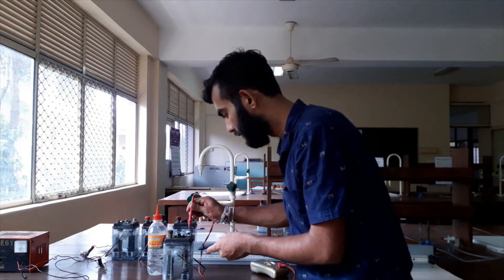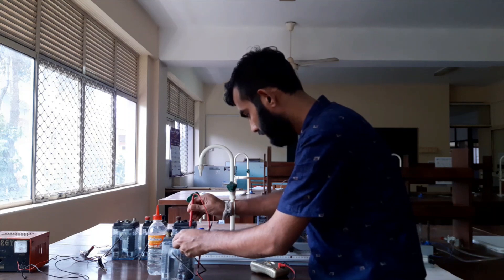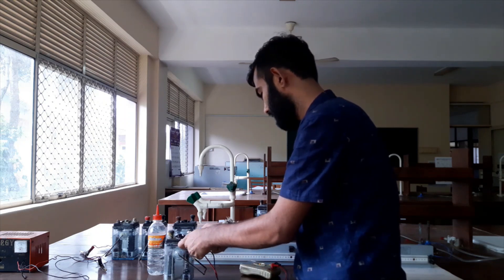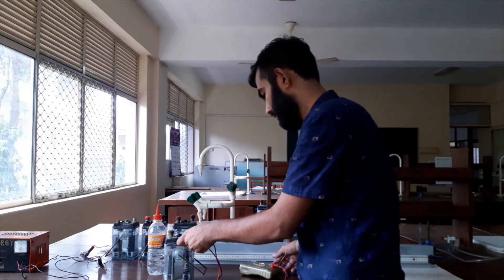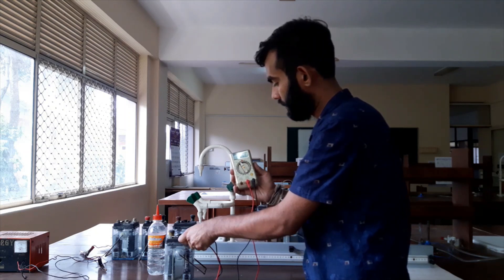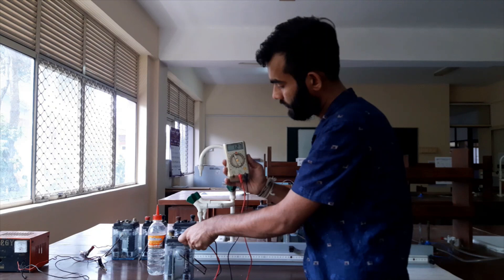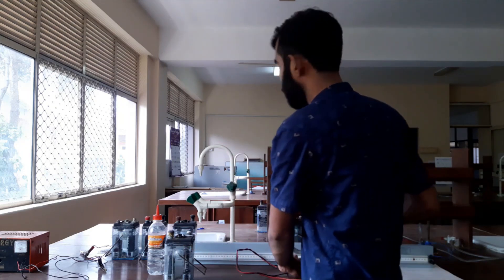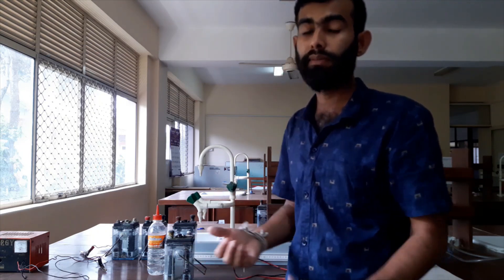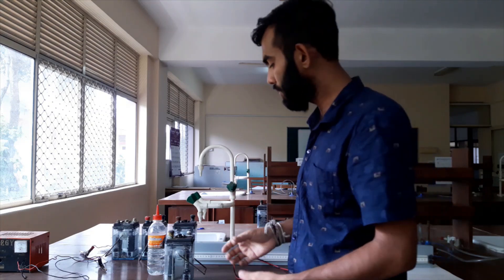Here is the positive terminal and here is the negative terminal. The voltage is nearly 1.29 volts. It should be 2 volts, so it is discharged. Its voltage should be nearly 2 volts, so we have to charge this battery before starting the experiment.